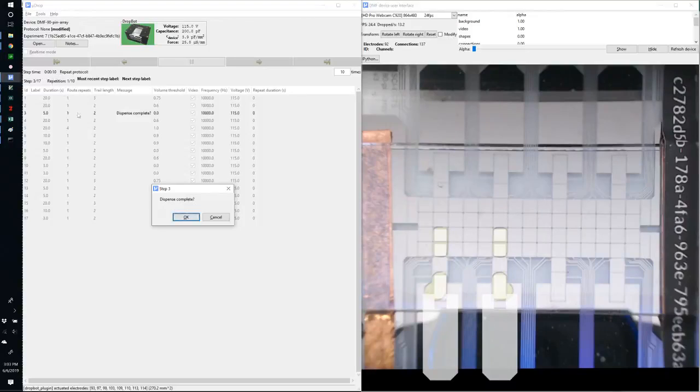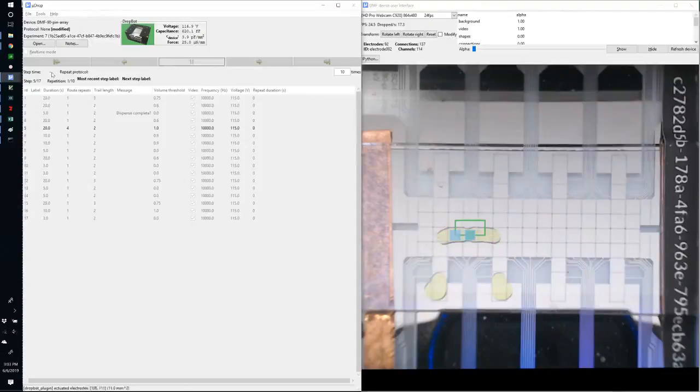And you can check the step time to see how long the dispense is taking. And so I did that, and it was under 5 seconds. So I set the time to 5 seconds and took the message away. So I did that for any steps where there was a split that was occurring. So it's not just detecting a split or a merge. So the steps where, for example, here in this split, it's only based on time right now, but I put a prompt in to see what that time was.